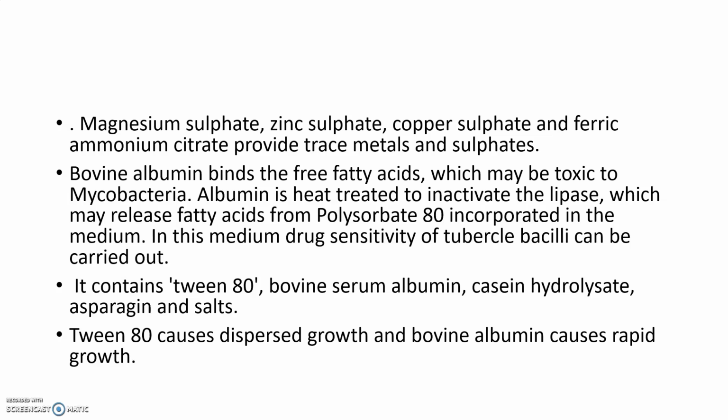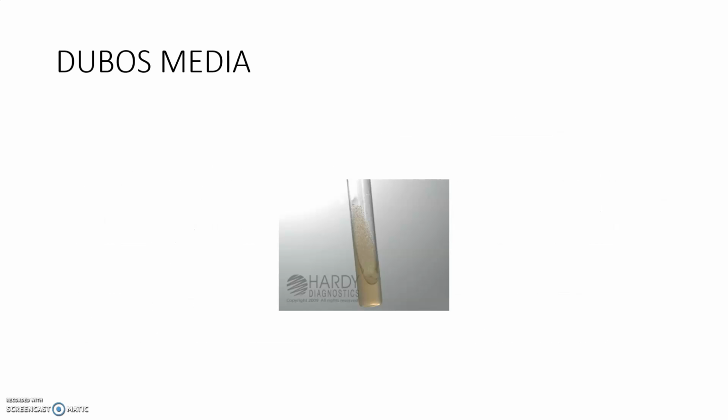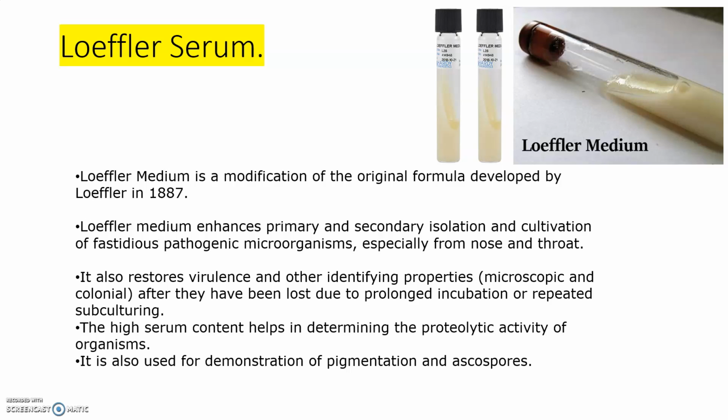So the contents within the medium. This is the Dubos medium. It is nothing but the liquid medium which promotes the growth of Mycobacterium tuberculosis. Next is Loeffler's serum slope, or Loeffler's medium. It is the modification of the original formula developed by Loeffler in 1887.